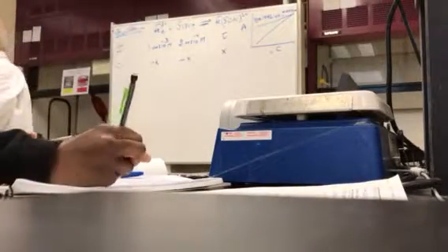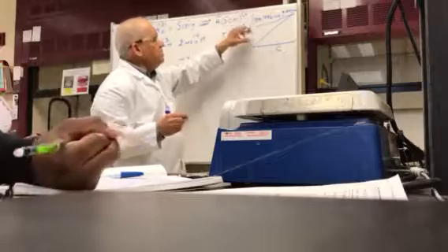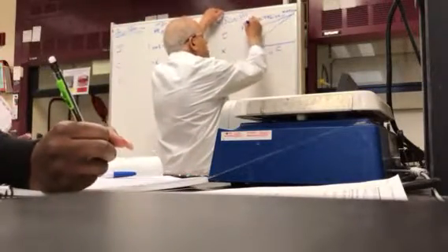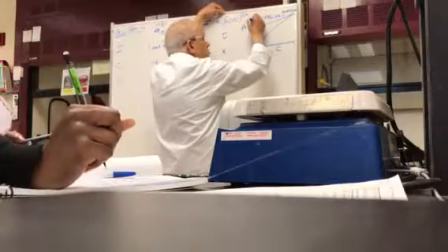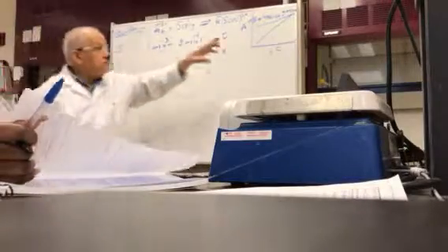I measured the transmittance for the equilibrium, convert to A, and I go to this equation here, and I will say, okay, my transmittance for the first one was 90% or whatever. I'm just going to throw a number here, for example. It was 0.35 absorbance, for example. And you substitute and find x. Okay? Is this clear? Yes.